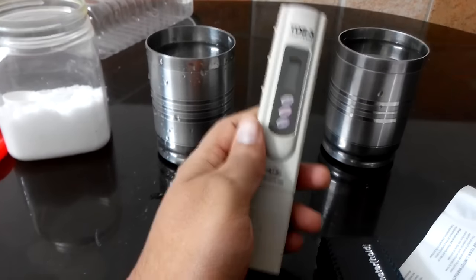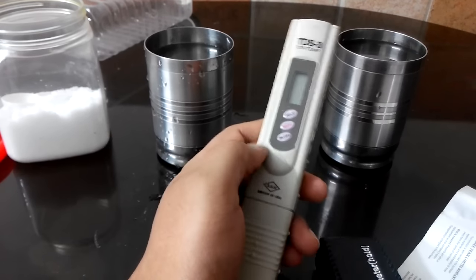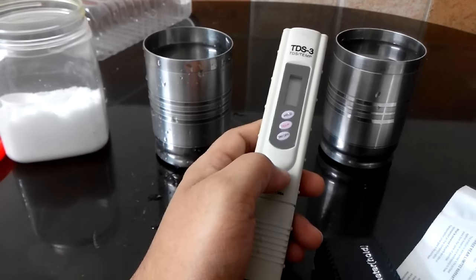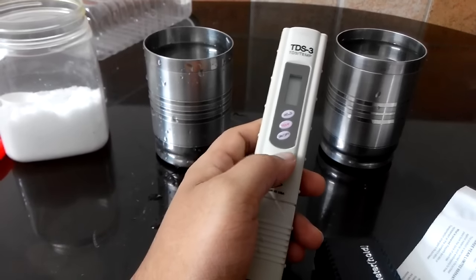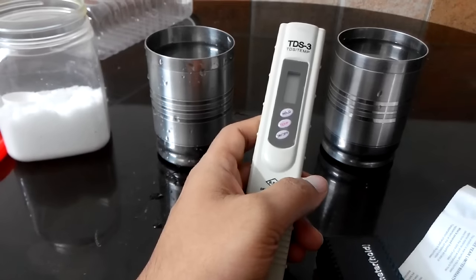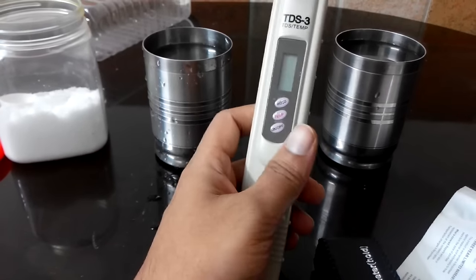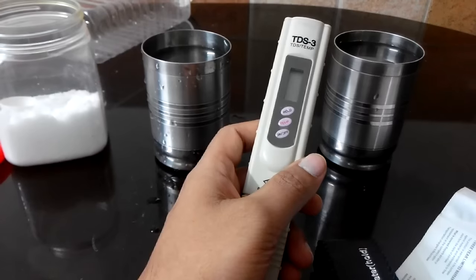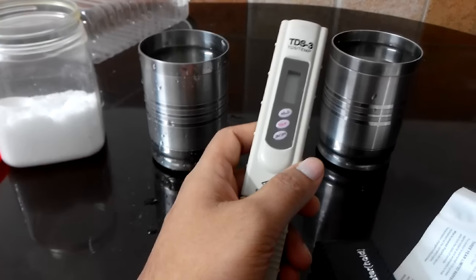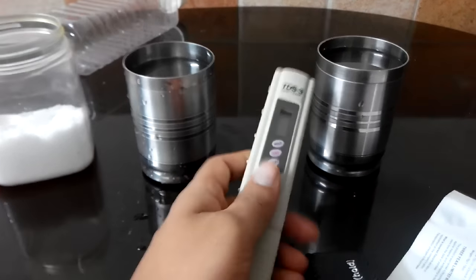According to WHO, if your water has TDS below 300 ppm — that is parts per million — it's excellent to drink. And if it's within the range of 300 to 500 or 600, the water quality is okay to drink. And if it's beyond 1200, then it's not suitable to drink.